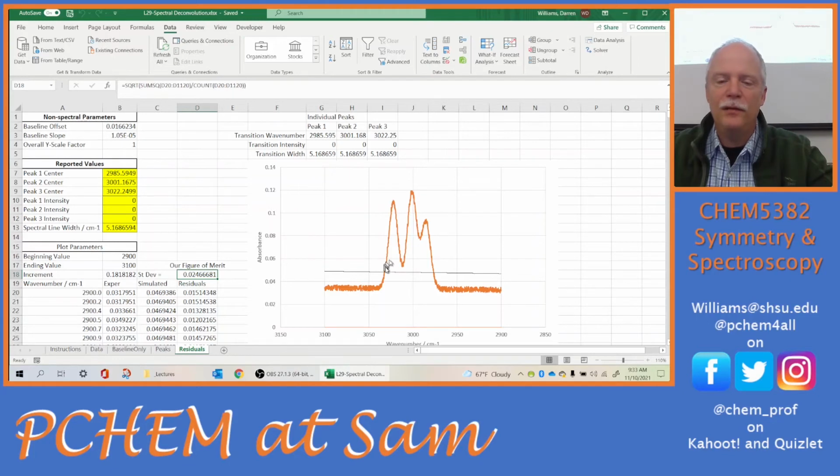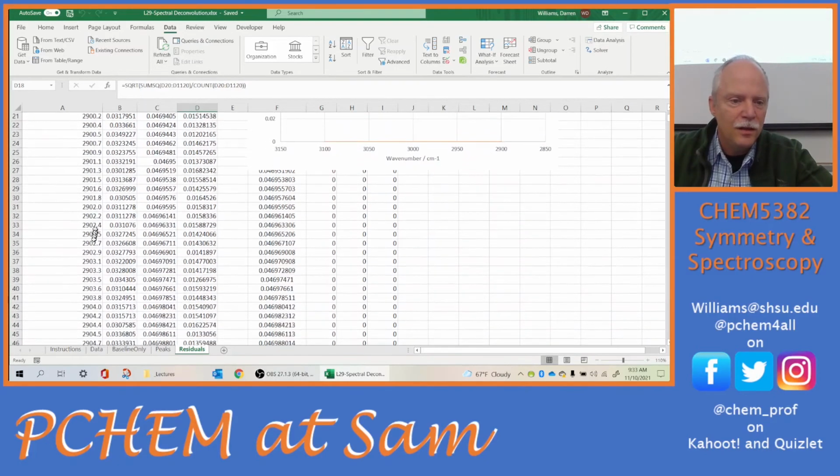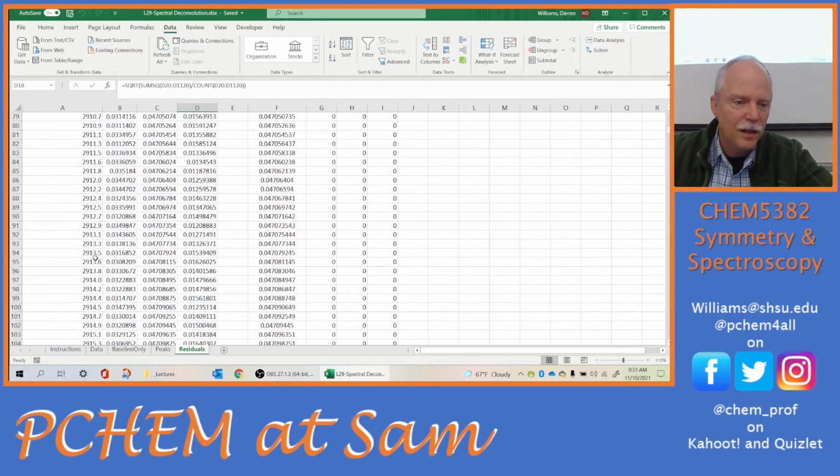So that's why just a baseline itself is not going to be very useful unless I restrict these residuals just to these regions. So let's just do that. I'm going to come down here just for grins. We're at 29. Let's go to 2950. So I'm scrolling down here. Here, 2950.